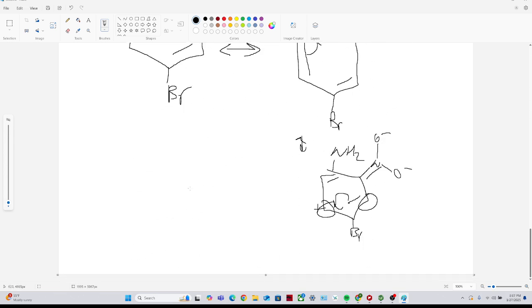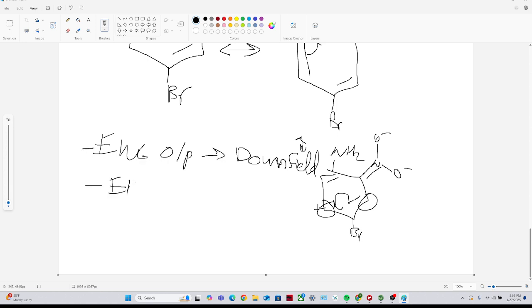And so, rule of thumb for electron withdrawing groups by resonance, if you're in an ortho or para position to them, you are going to have increased positive charge, meaning you're going to be downfield. Okay, so electron withdrawing, ortho para, are going to be not more upfield, my apologies, more downfield. More downfield. And additionally, electron donating by resonance, again, all these are by resonance, you're going to get ortho-para positions, but they're going to be upfield, okay?